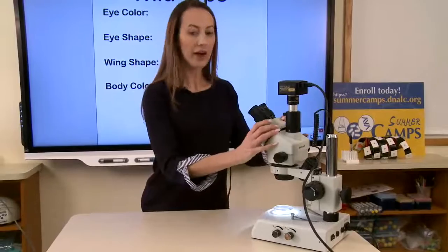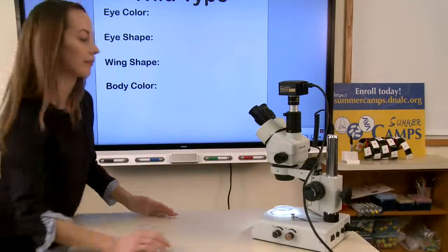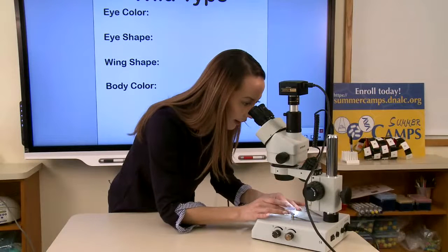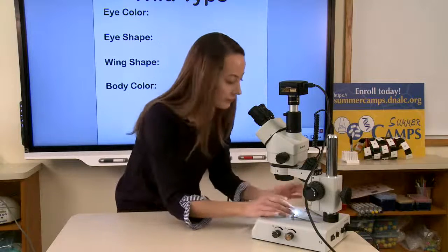So if I start to take a look, okay, I'm going to place mine underneath the microscope, look through, and I'm going to start to find fruit flies. Okay.